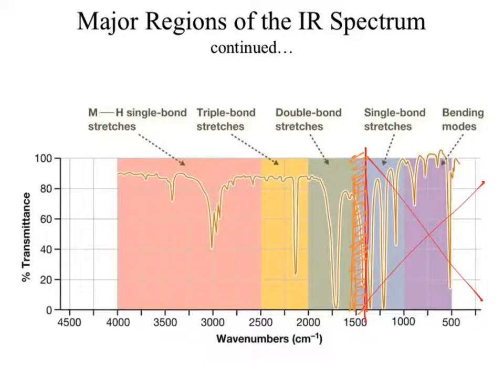That's why the textbook shows you a bunch of them within that chapter. That's why there's the background file that doesn't just say these are the ones you need to memorize. It shows examples of what those things look like. Every time we change an atom, we change the bonds around it. That can change the signal. So we have to be very careful to not overanalyze.